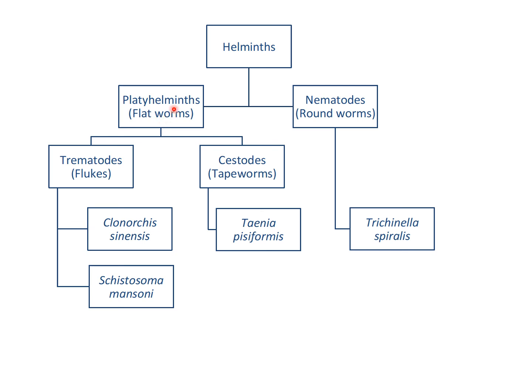And then if we take a look at the flatworms or the platyhelminths, there are two subgroups. There are the flukes and the tapeworms, or basically trematodes and cestodes. And again, I'm just showing you examples. Make sure that you do know the names of the phyla. Know what's the other name for a flatworm. So the phylum would be platyhelminths. And then know again, for these subgroups, tapeworms would be the cestodes, flukes would be the trematodes.